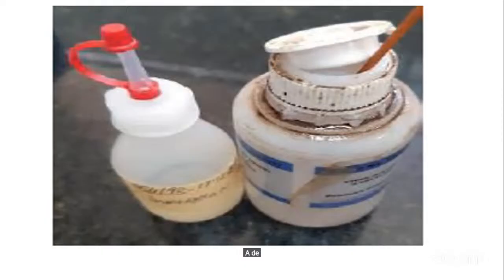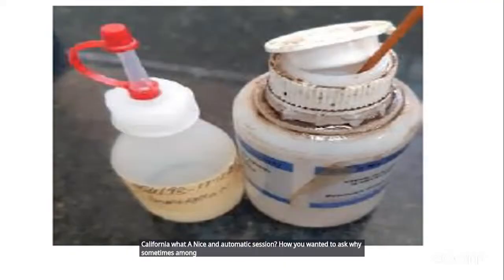And this is from Caleb Koech. What a nice and informative session. I only wanted to ask why sometimes when I'm observing under power 100, you can see some moving organism. Does it mean my immersion oil is contaminated or something? Okay, Caleb.